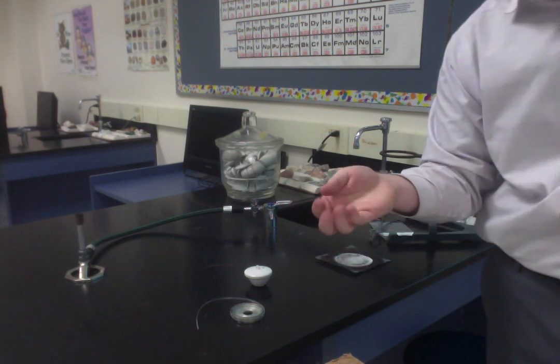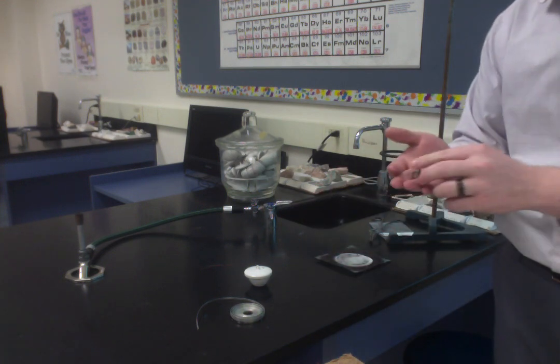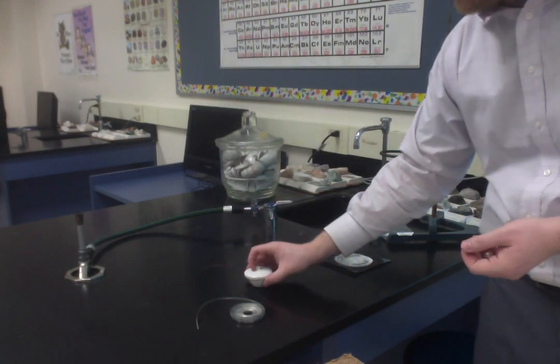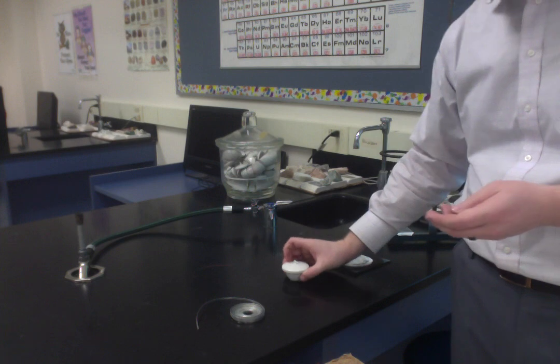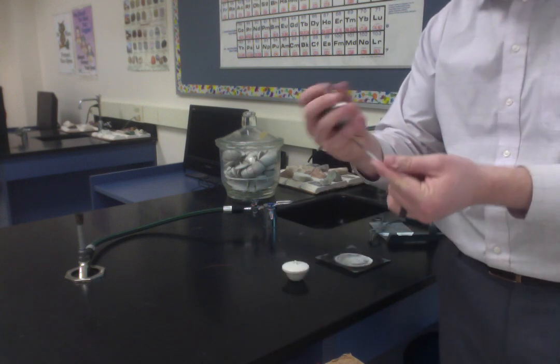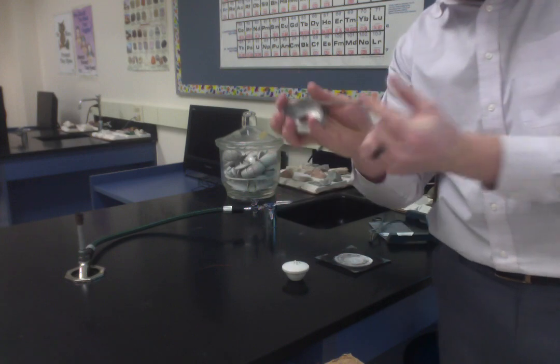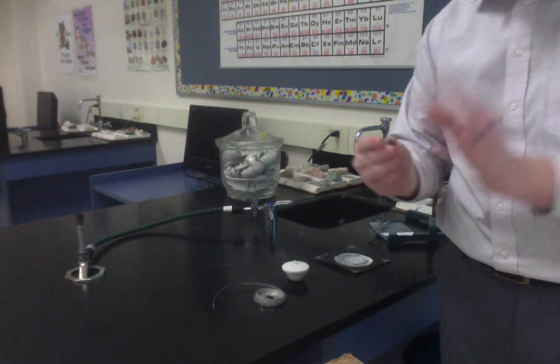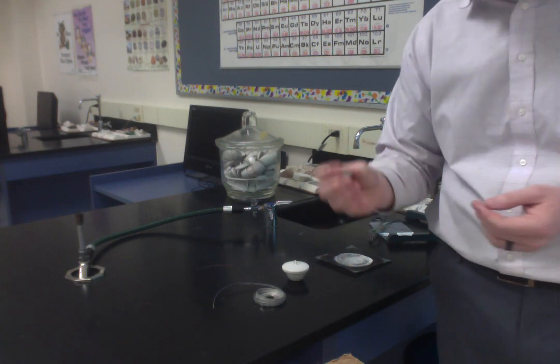Now, your teacher might have you find the mass of this in a couple of different ways. You can either just put it on the balance straight up, you can put it inside what's known as the crucible, or you might even do a density analysis where you're given the density of this, and you're going to get the length and go from there. So however you find the mass of the magnesium, that's what you're going to start with.